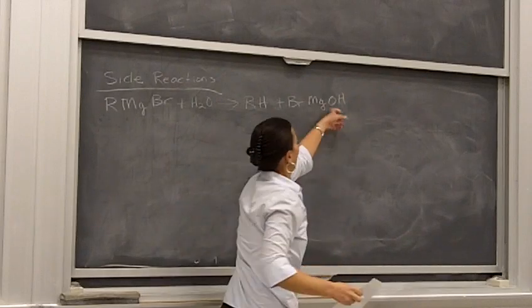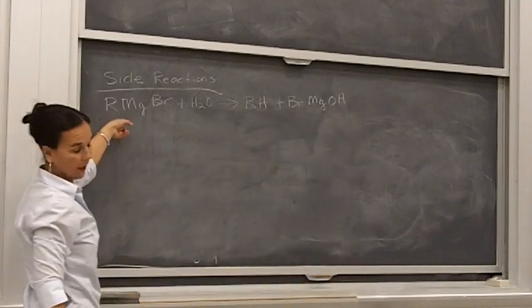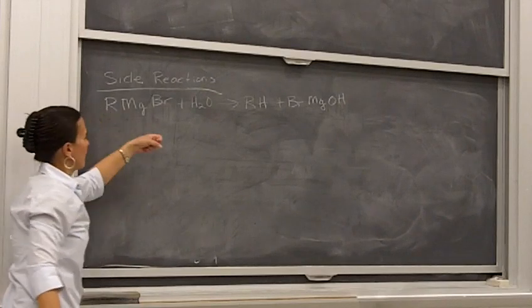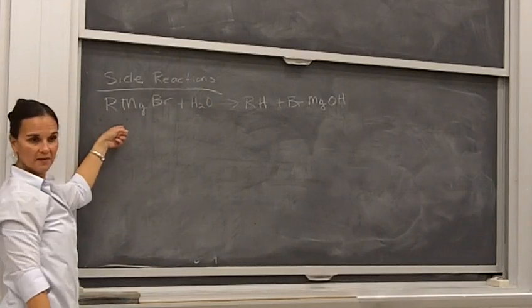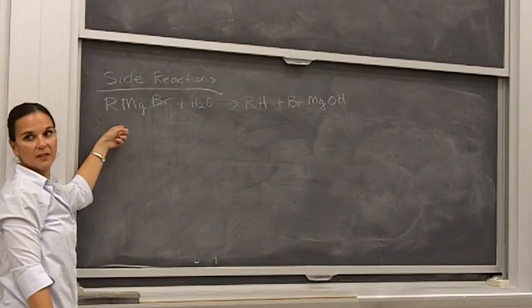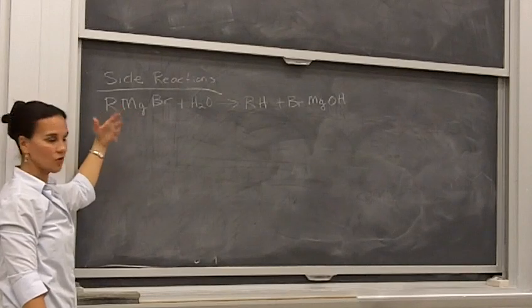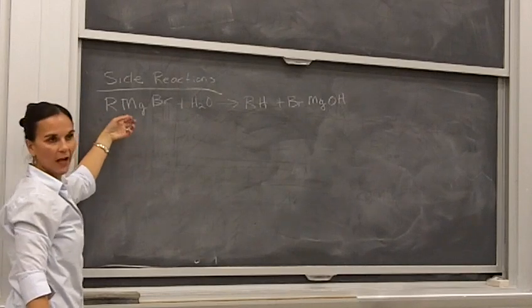So basically we get hydroxide of our organomagnesium bromide, okay? Now it always happens that the week we do Grignard, it also is going to be rainy and damp and things like that when we're trying to keep things really dry. So we'll work extra hard this week.